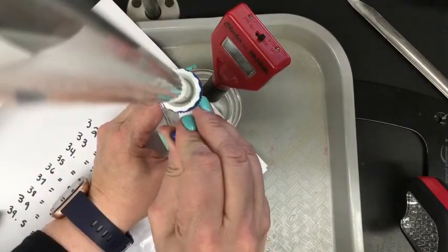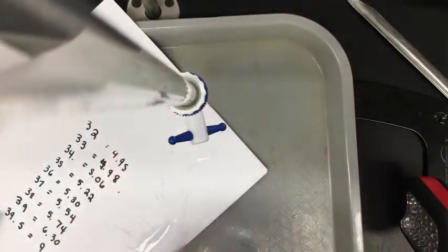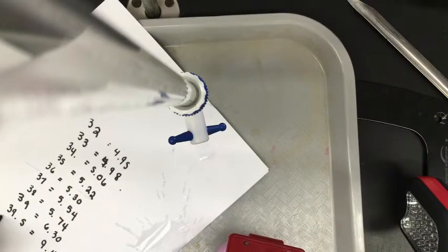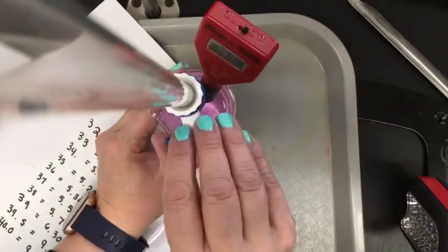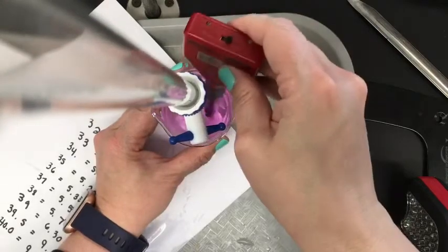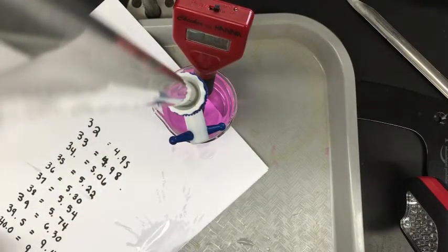So I'm going to add another half. Now we're at 40.0 milliliters added. We're at 9.75. I had a little splash there. We'll do another couple readings. 40.5, we're at 11.02.